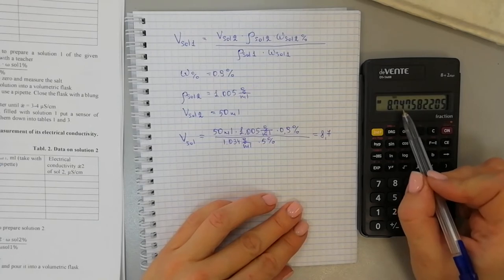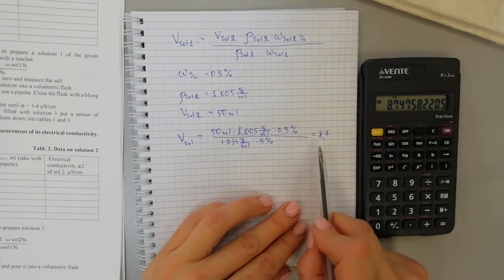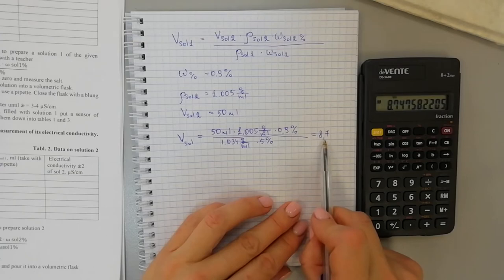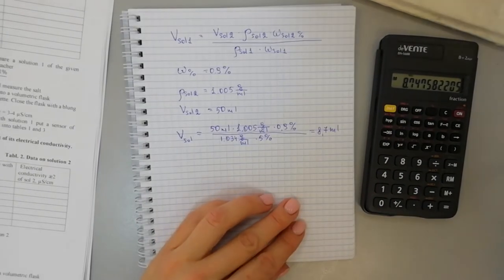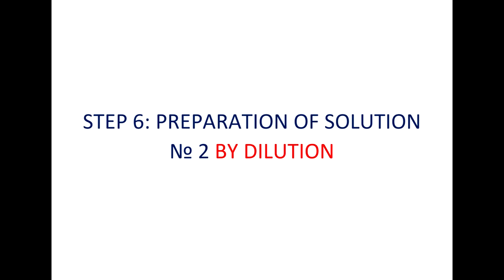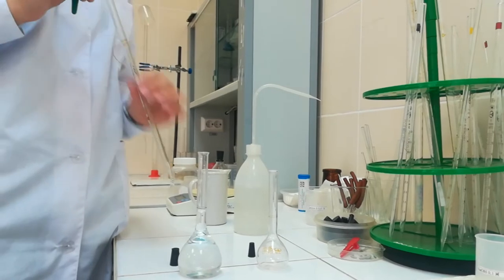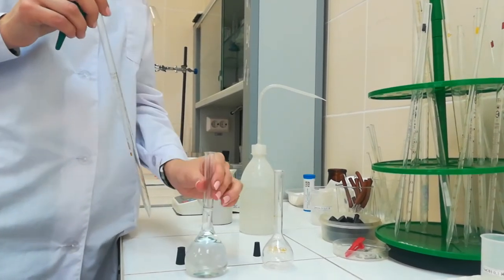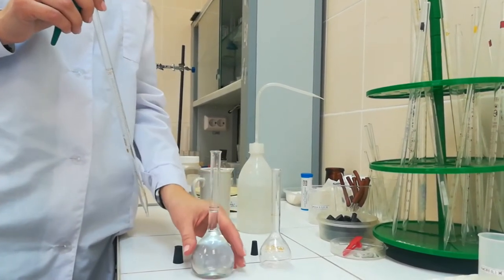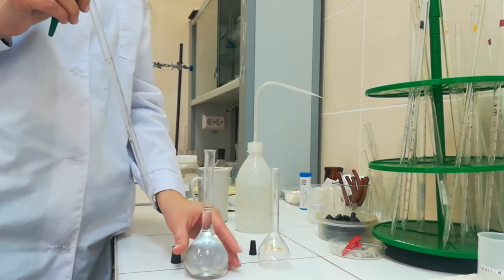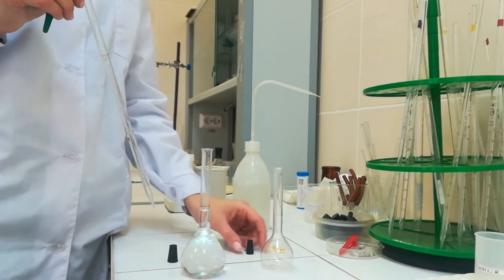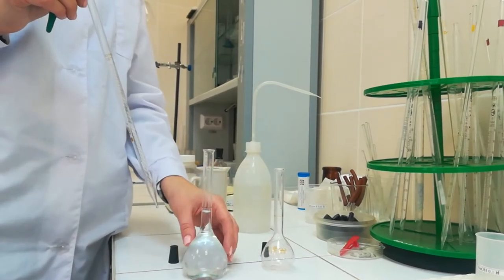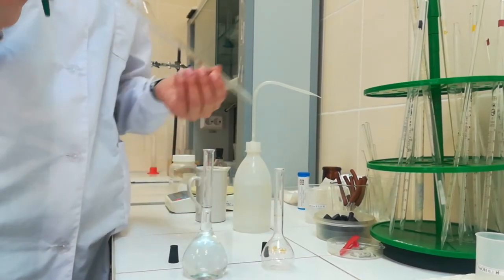We get a number which we round to 8.7 milliliters. So we have to take 8.7 milliliters from solution number one and put it into another, smaller flask. To measure 8.7 milliliters I will use a pipette.